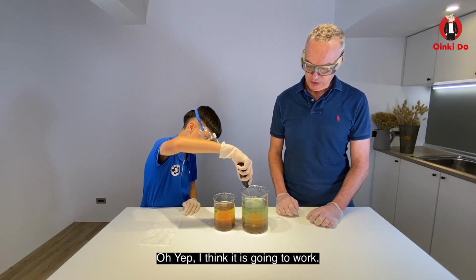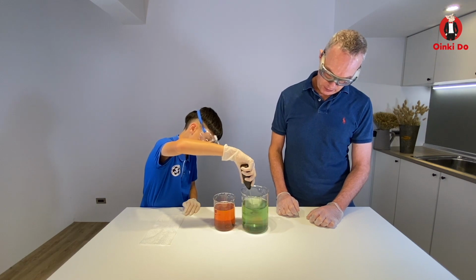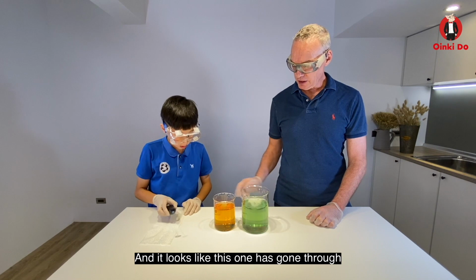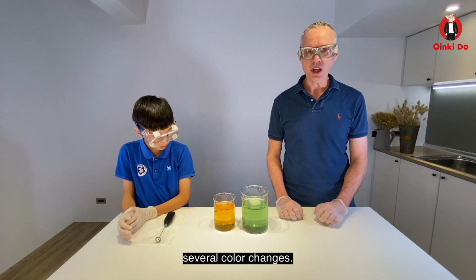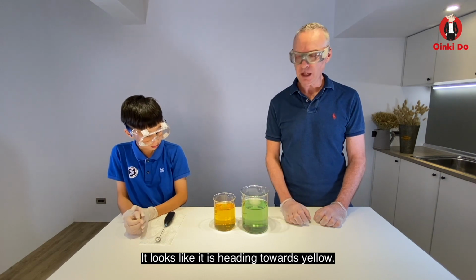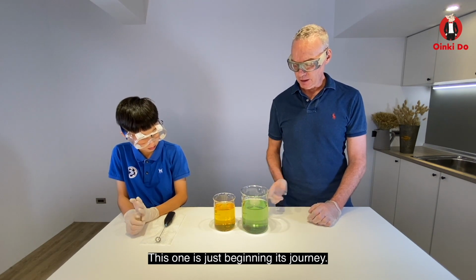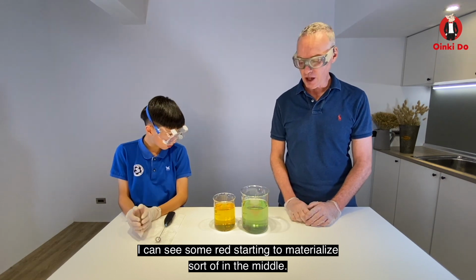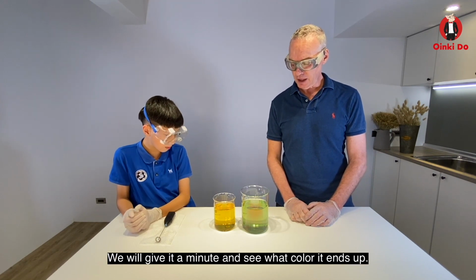Oh, yep, I think it's going to work. All right, that looks green too. And it looks like this one has gone through several color changes. We've gone through some red into oranges, and it looks like it's heading toward yellow. We'll see if it makes it that far. This one's just beginning its journey. I can see some red starting to materialize sort of in the middle. We'll give it a minute and see what color it ends up.